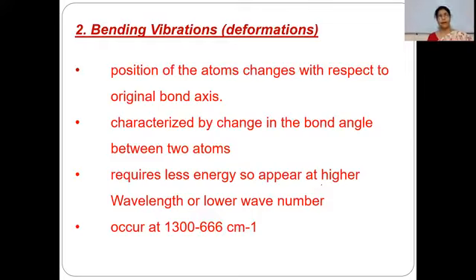Obviously, it is a practical concept. If we have a thick spring, it requires more energy for its compression and for its stretching, but we can easily bend it. So that's why bending vibration requires less energy.